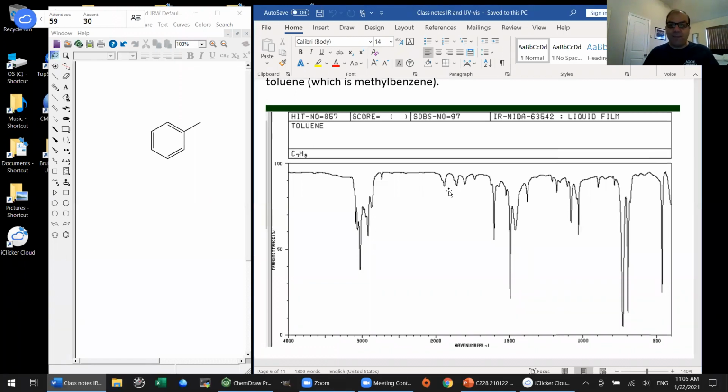I'll be saying the same thing when we get to mass spectrometry, which I believe will be Monday. Same thing when we get to carbon NMR, and same thing finally when we get to proton NMR. The best way to get experience is by going and looking at actual spectra. So from this, I think you can see there are, again, some subtle differences. As for some of these peaks here, we probably could identify some of these.